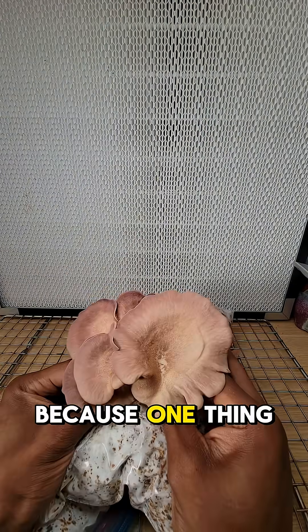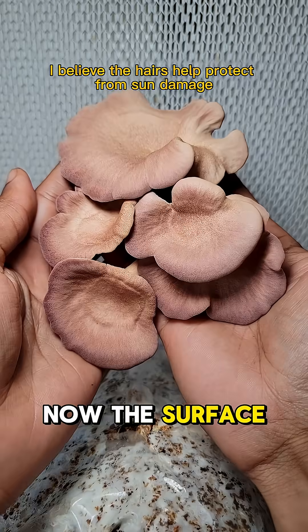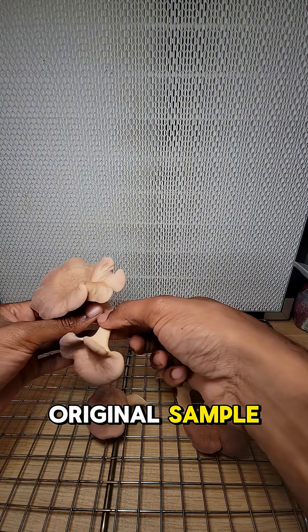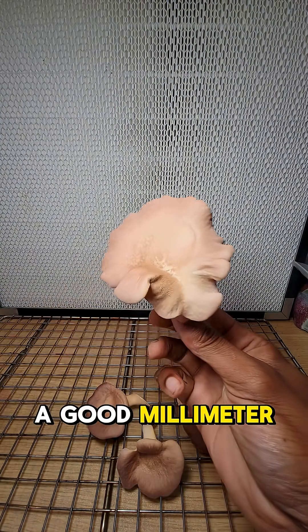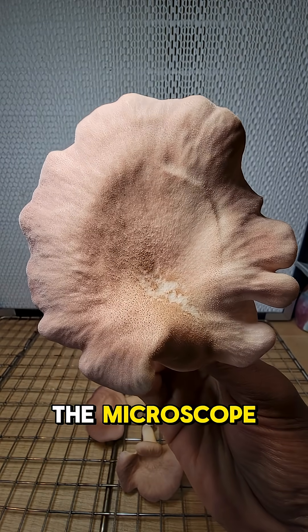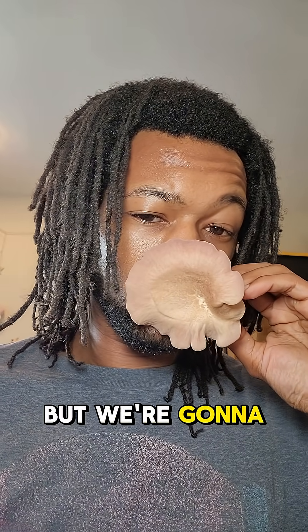Next time I'm going to let them go even further than this, because one thing that didn't pop up too much were the tiny hairs. The surface was definitely very rough, but in the original sample the hairs were like a good millimeter to two millimeters long, and this one has none at all — maybe under the microscope, but not that you can see with the naked eye. But we're gonna do more experiments.